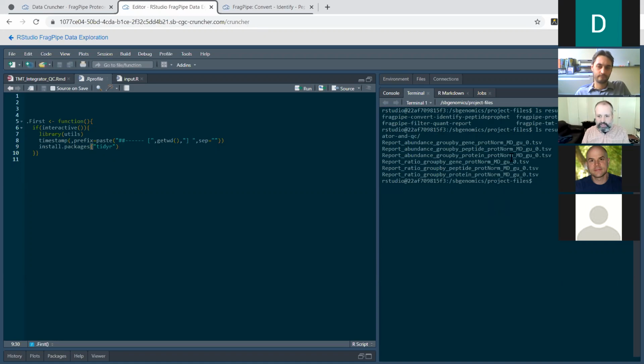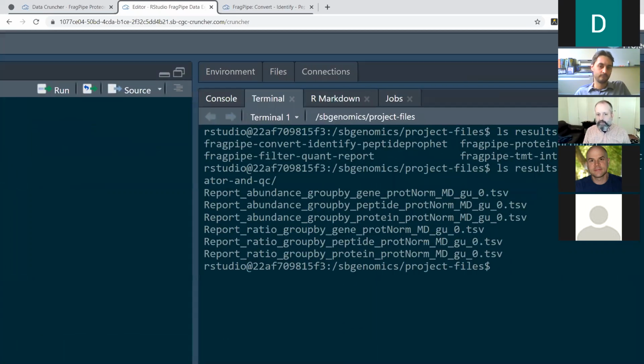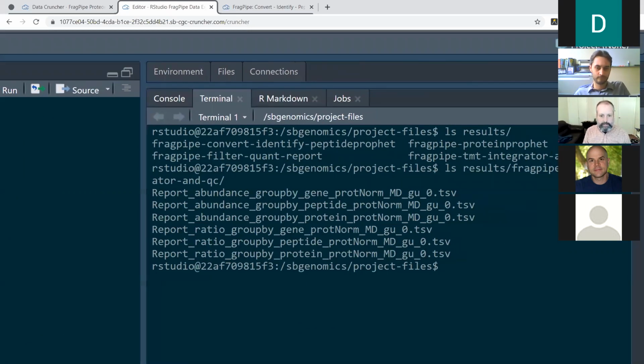I don't know if you can see that. Yeah, we're going to critique. Yeah, we want to distribute the webinar. I think Dan's going to help us do that. Thank you. But yeah, there's different abundances: group by gene, group by peptide, group by protein, different ratio things. Those are all there for you to ingest into R and make plots on.